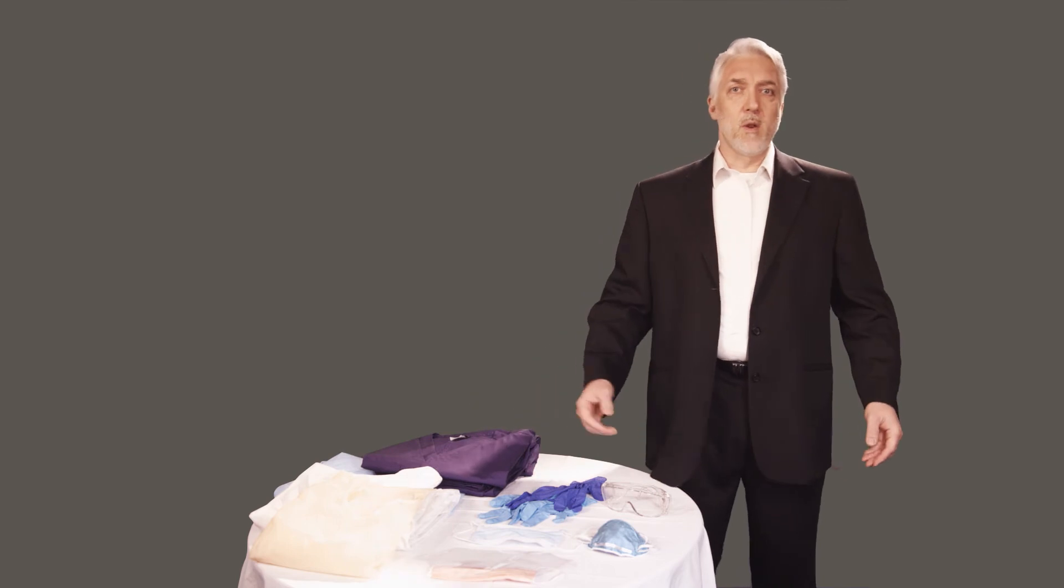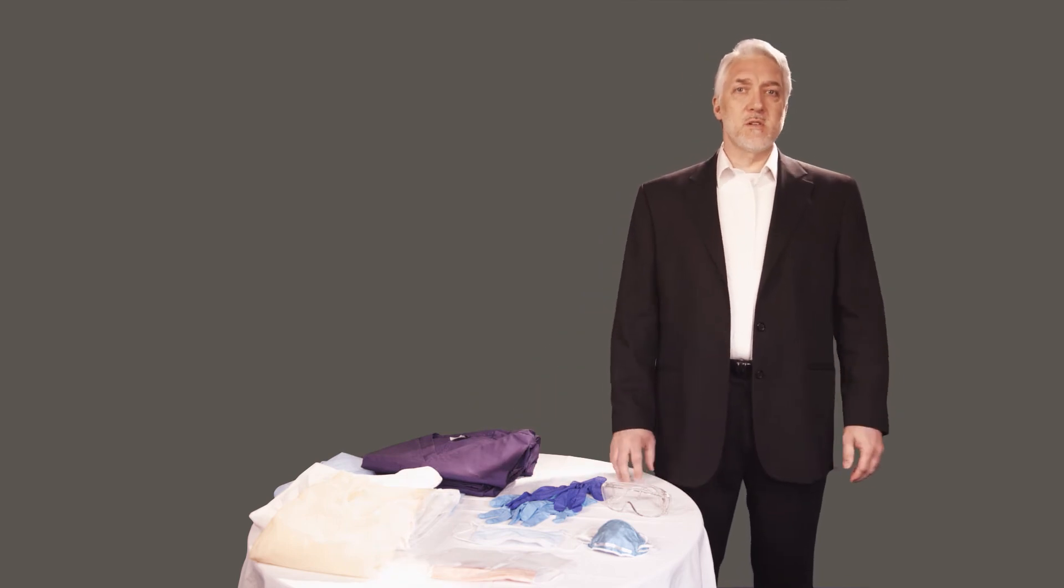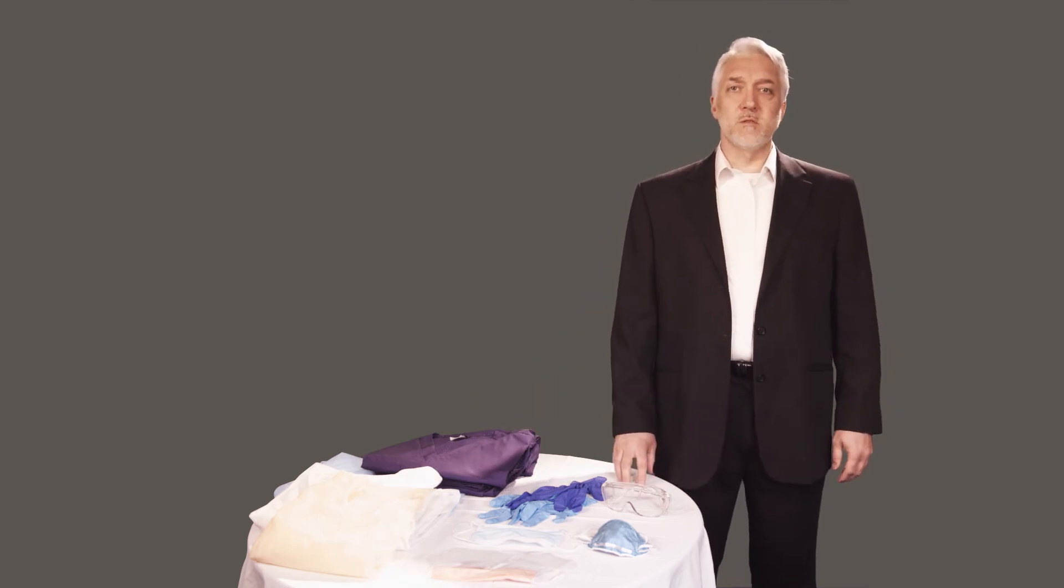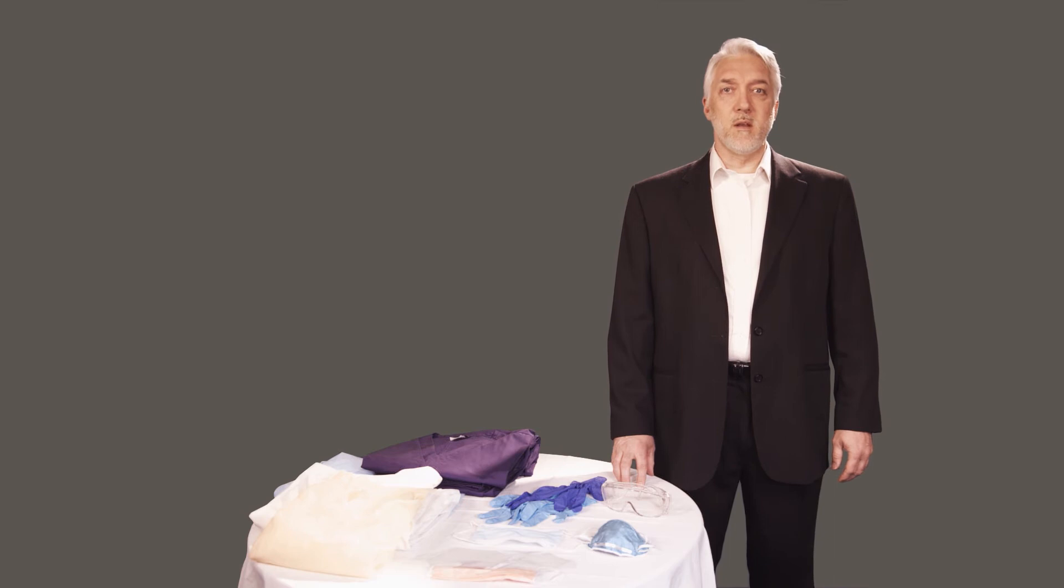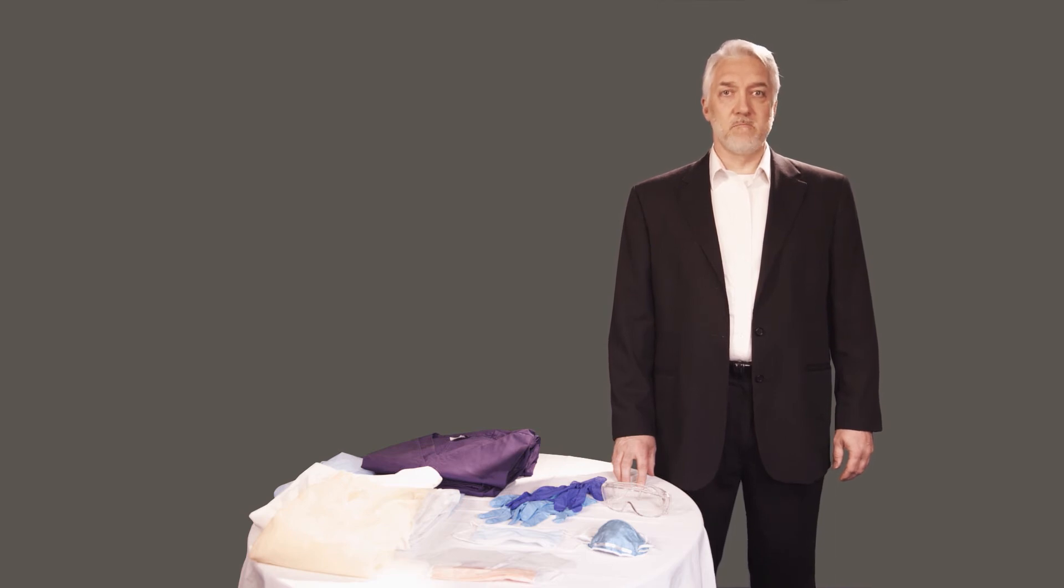If blood or other potentially infectious materials penetrates your protective clothing, you must remove the PPE as soon as the situation allows.